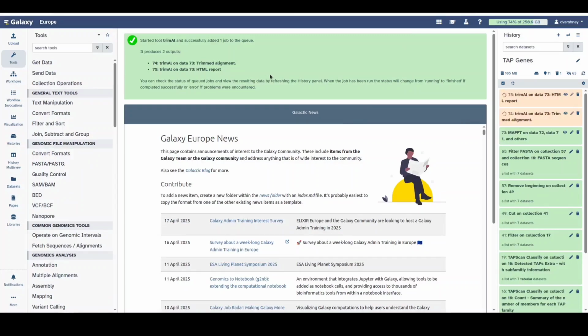What kind of output can we expect from trimAl? It will give you the alignment, of course, but it would be the trimmed alignment. We assigned 2 parameters, so that we remove the poorly aligned regions which have gaps lower than 50%, and also similarity less than 0.001. Okay, so it seems like the trimAl job has finished. So let's check the result.